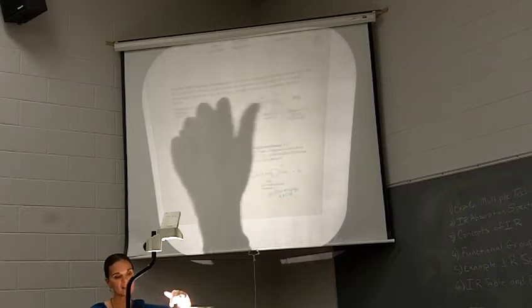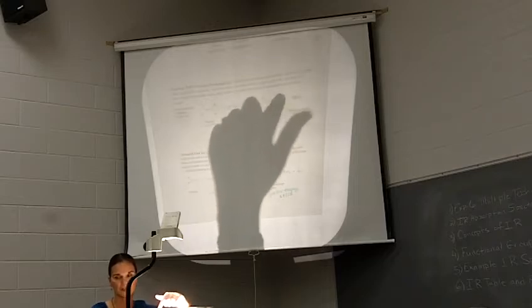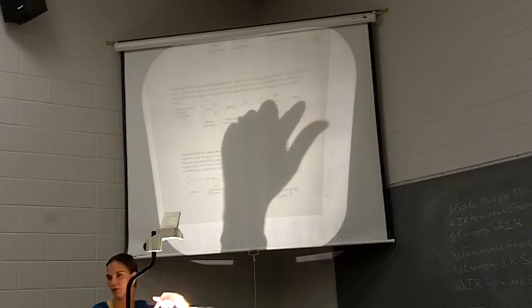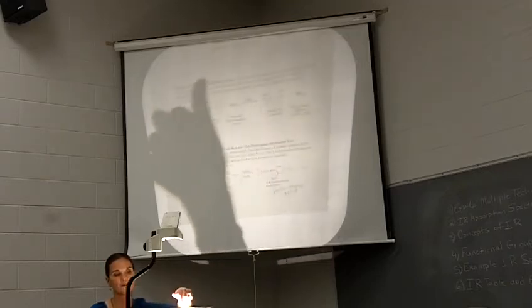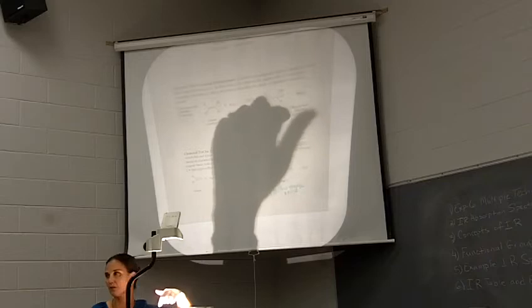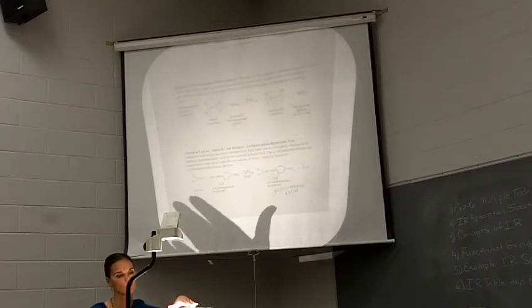What you will see is, you may not see that much of that solid right away, but that color starts fading and turning a different color. That's most likely it reacting with the alkene and starting to work towards the manganese dioxide forming. The bromine test is really instantaneous. Give the potassium permanganate one like 2 to 5 minutes because it takes a little bit longer to react, okay? But you need both of those to be positive to have an alkene.